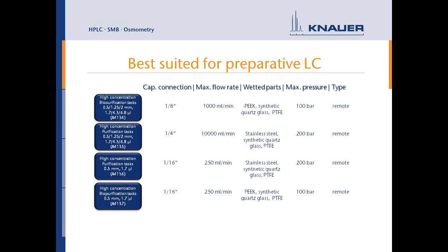Now that was a lot of different flow cells. I don't expect any of you to have looked at all of these specs or whatever, but what I wanted to do here was just to show how many different opportunities we have with this device. But let's see, which one are we going to choose for which task? That is the key question in this webinar.